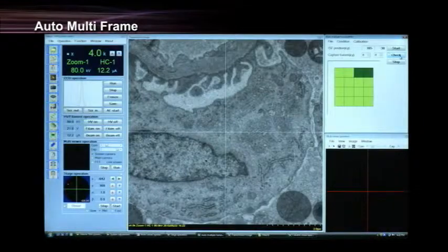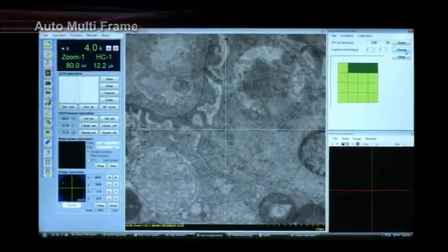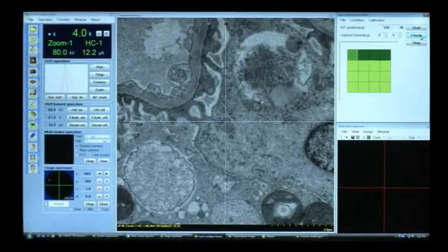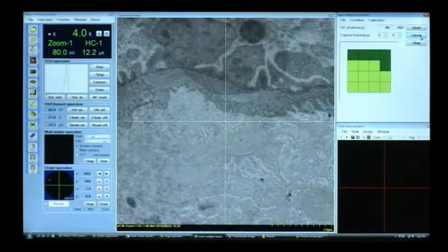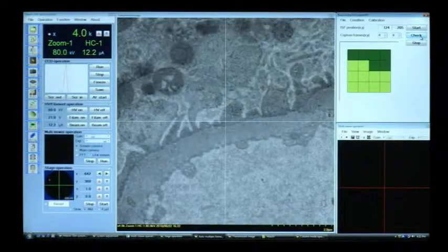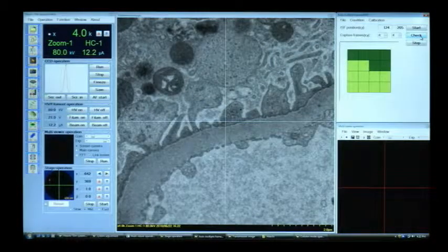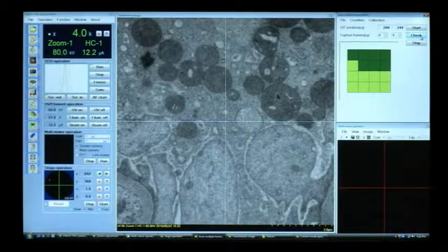The HT7700 montage acquisition uses both mechanical stage shift or digital image shift to acquire a sequential set of images. Acquiring continuous images is possible by both methods, utilizing Hitachi's unique auto-multi-frame function.